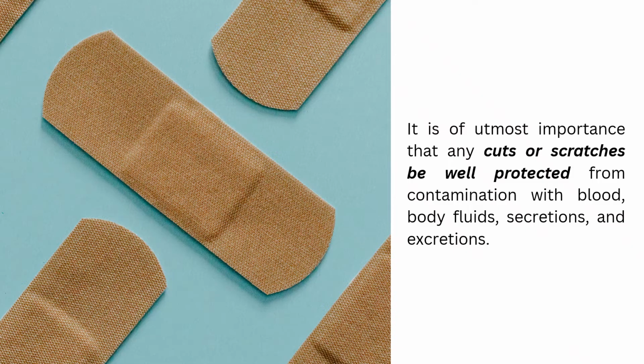It is of utmost importance that any cuts or scratches be well protected from contamination with blood, body fluids, secretions, and excretions. So, as much as possible, if you have wounds, open wounds, scratches, you cover them, especially when you work inside the laboratory. That is to prevent any contamination and infections on your end.